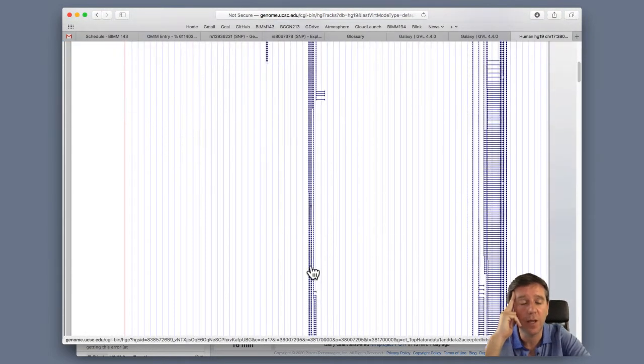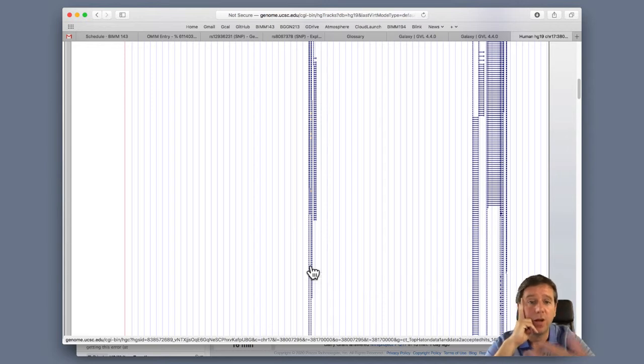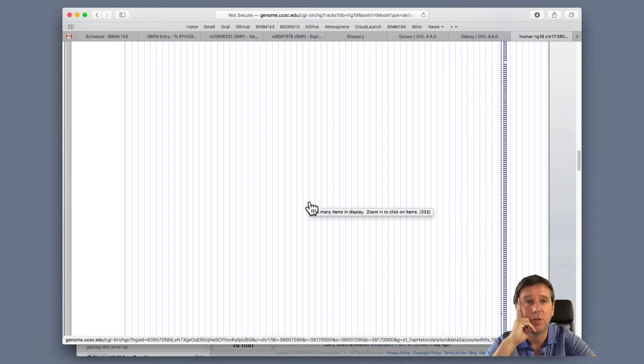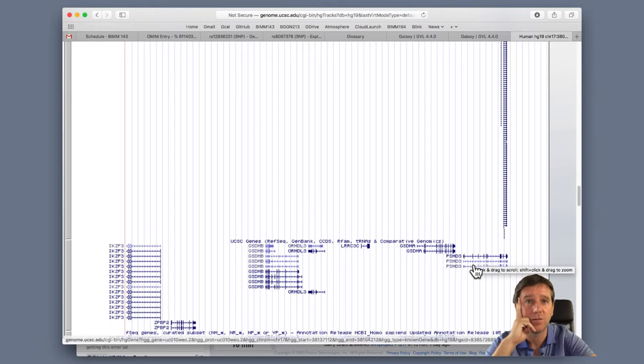So there's a lot, and this individual, this British male that was GG, that was homozygous for this asthma SNP. This is their RNA-seq data that we've analyzed, and this is the expression at the time of that experiment for these genes, okay, that we want to determine by counting up all these reads for these genes.